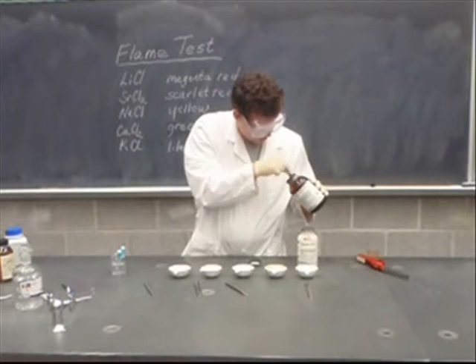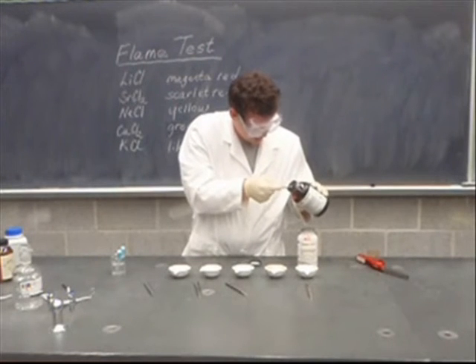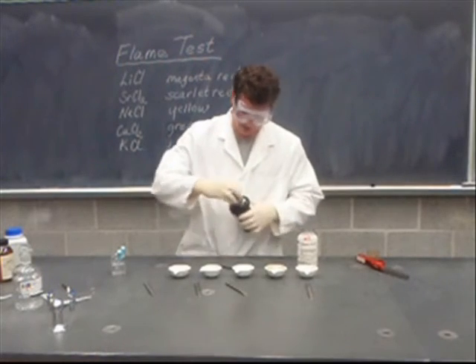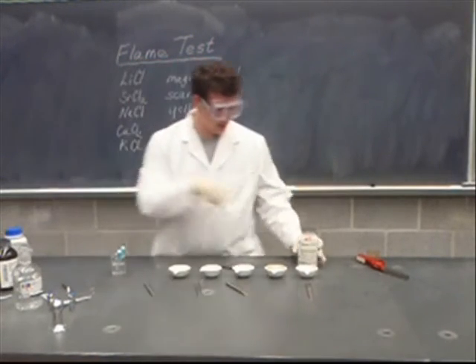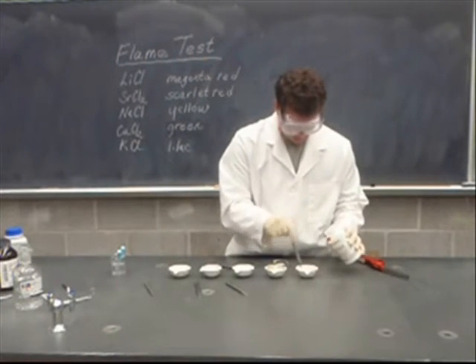You want to make sure you break up the chemicals. They are stuck together. More of a powder. And last, we have a potassium chloride. Not too much of it.